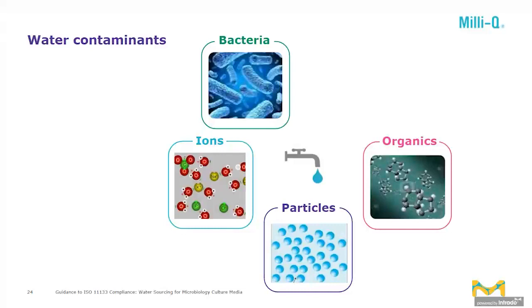Other things that could be present in your tap water are organic molecules. Organic molecules can come from nature as well, from the decay of plants and leaves, like humic acid. But organic molecules may also come from human activity. It could be small residues of pesticides or of medications that we take, potentially even antibiotics and things like this.